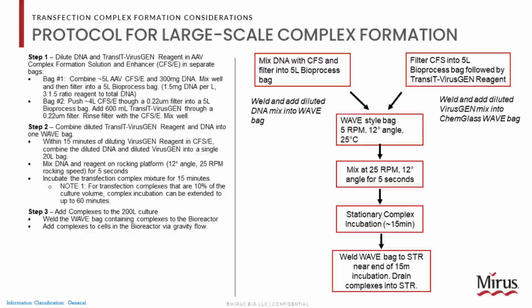Next, using a wave style bag, here giving it a quick gentle mix, only a 12-degree angle, a 25-degree C temperature with just 5 RPMs, just holding it at room temp. After letting that sit for 15 minutes, at this point they would then weld that complex onto the bioreactor and then gravity drain it.